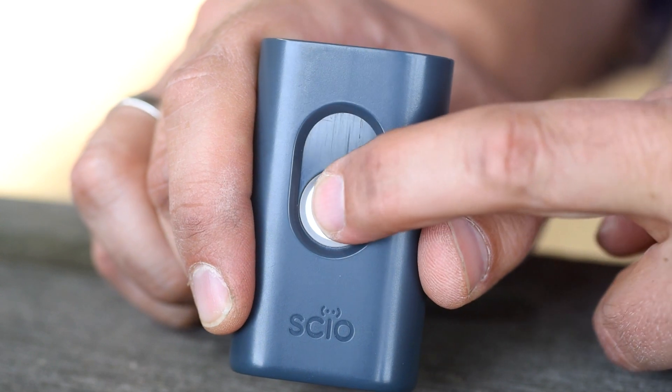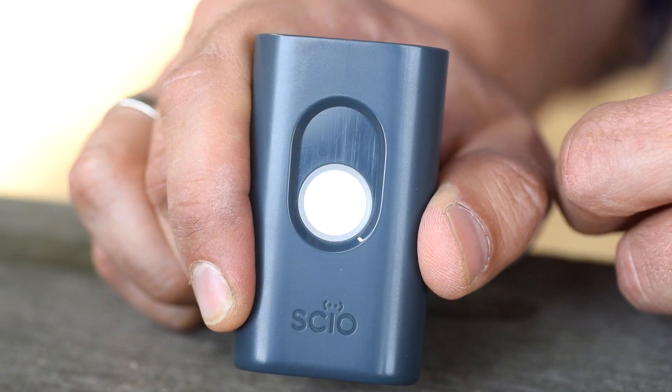Turn Sayo on by pushing the function button for about a second until the LED light turns on.